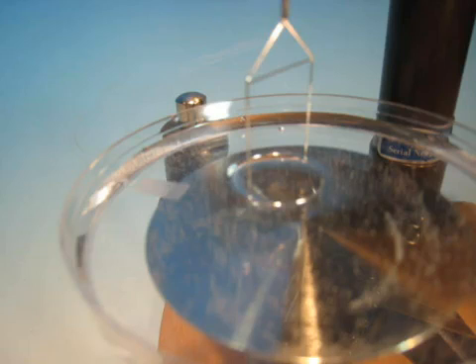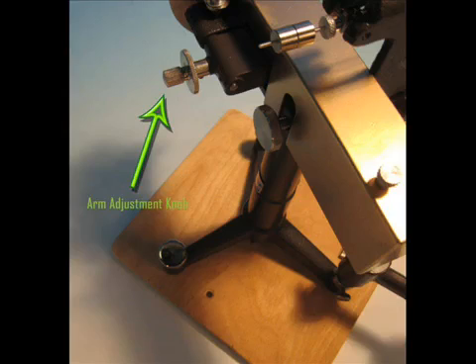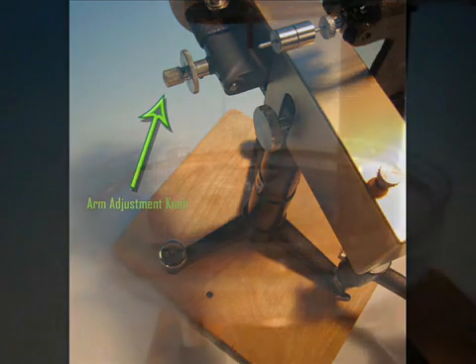At this point, use the arm adjustment knob to move the pointer back to the mirror line. Repeat this process of slowly lowering the sample until the pointer moves above the mirror line.